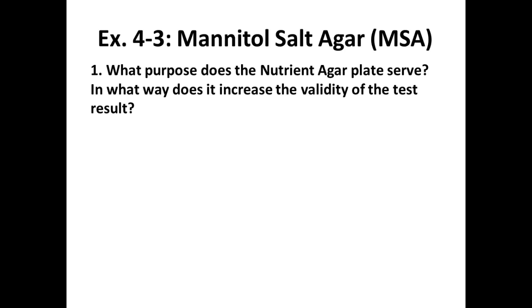So we didn't do this because you guys have already seen your organisms growing on Nutrient Agar, right? In your slants or TSA might have been the regular growth media. Why would you do just a regular growth media and grow your organism? What purpose would that serve in an experiment? Just to see the normal growth on normal growth media. What do you guys think? A control, right? As a control.